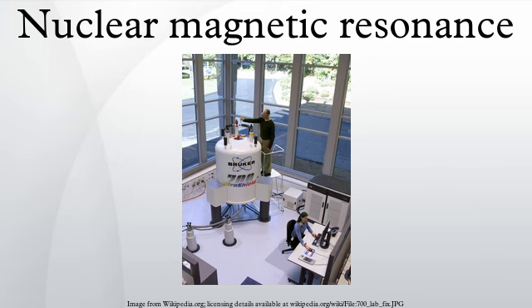The principle of NMR usually involves two sequential steps: the alignment of the magnetic nuclear spins in an applied, constant magnetic field H0, and the perturbation of this alignment of the nuclear spins by employing an electromagnetic, usually radio frequency, pulse. The required perturbing frequency is dependent upon the static magnetic field and the nuclei of observation. The two fields are usually chosen to be perpendicular to each other as this maximizes the NMR signal strength.